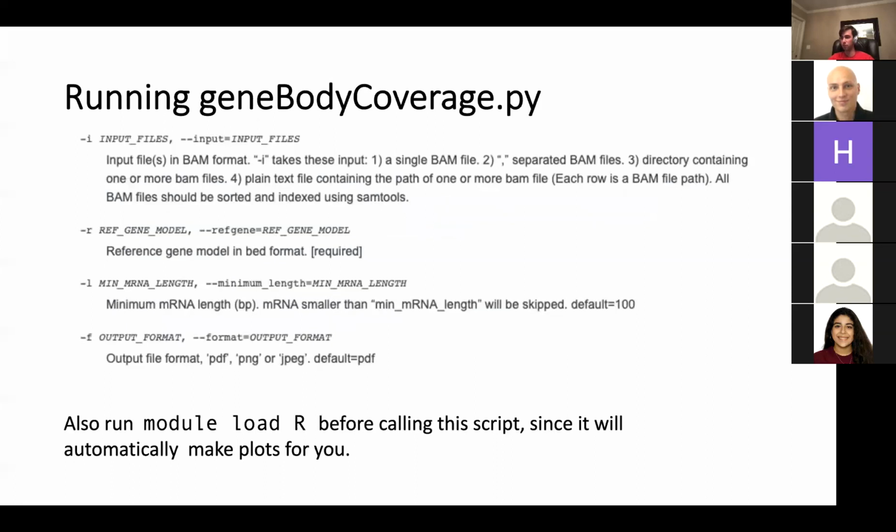Sorry, could you go over one more time how to run the tin.py? Like, where does the path directory to the file go, before or after writing out tin.py, and then the specifications for input file, reference gene model, etc.